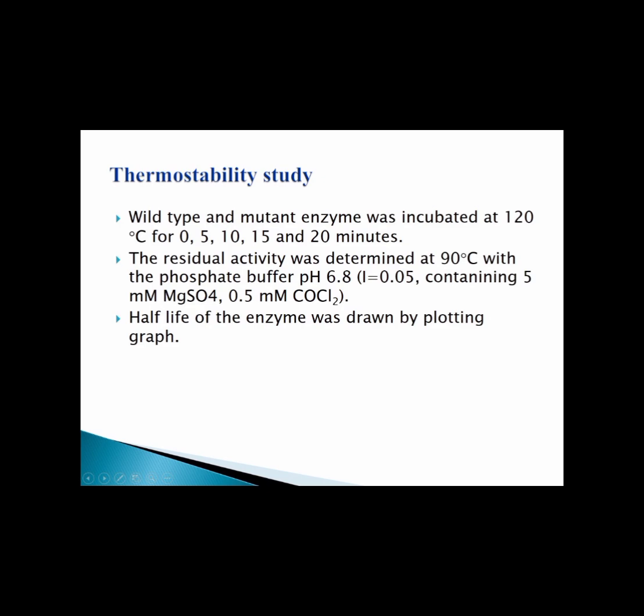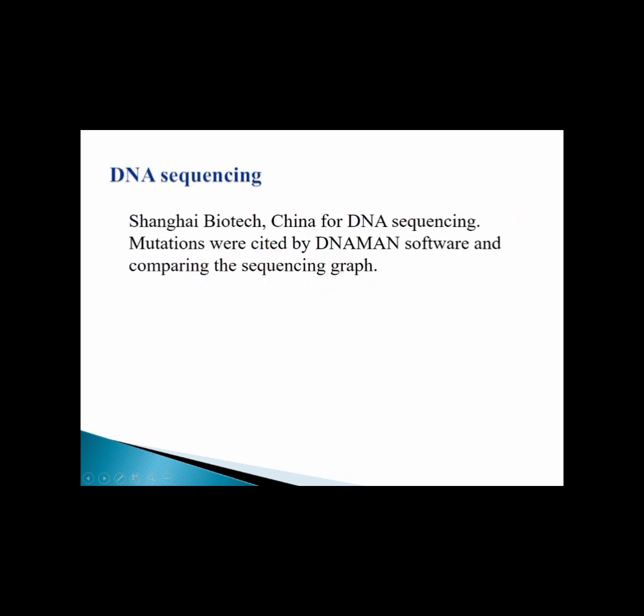Then thermostability study was performed. Wild type and mutant enzyme was incubated at 120 degrees centigrade for 0, 5, 10, 15, and 20 minutes. Then the residual activity was determined at 90 degrees centigrade with phosphate buffer pH 6.8. And half-life of enzyme was also determined by plotting a graph. Then DNA sequencing was performed to confirm the mutation.